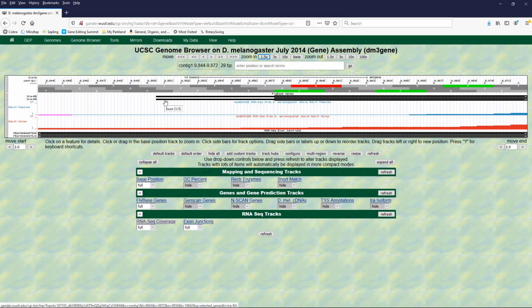Now we notice that we have something new that we can see here. We have 3 rows of shaded area up here, just above the contig. And you will see some letters in there. Any idea what those letters might be? Those are amino acids. So why do we have 3 different rows of amino acids? Well, because there's 3 different reading frames.